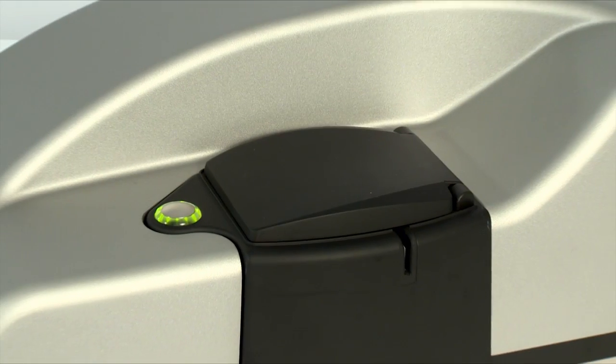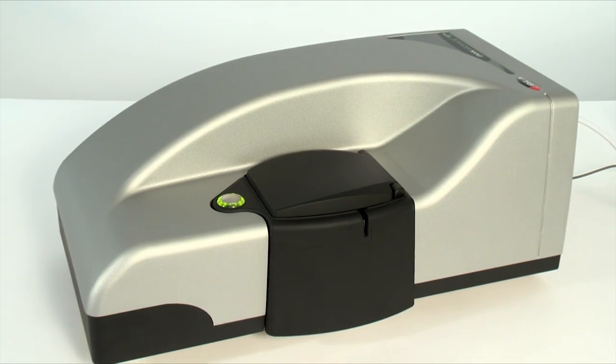Together, all these points combine to make the highest quality protein mobility measurements possible.